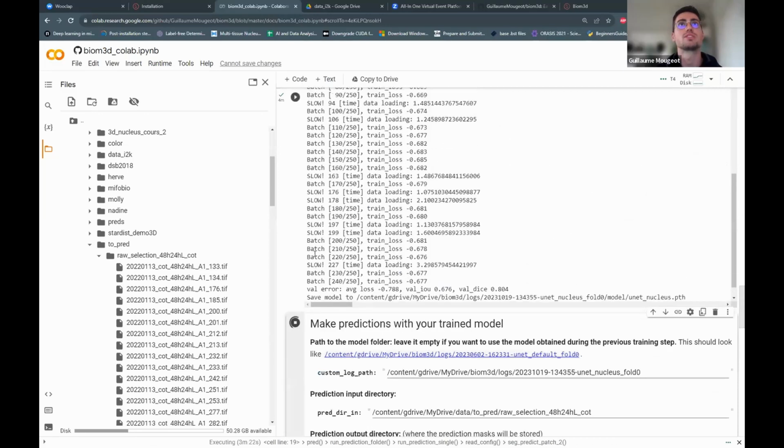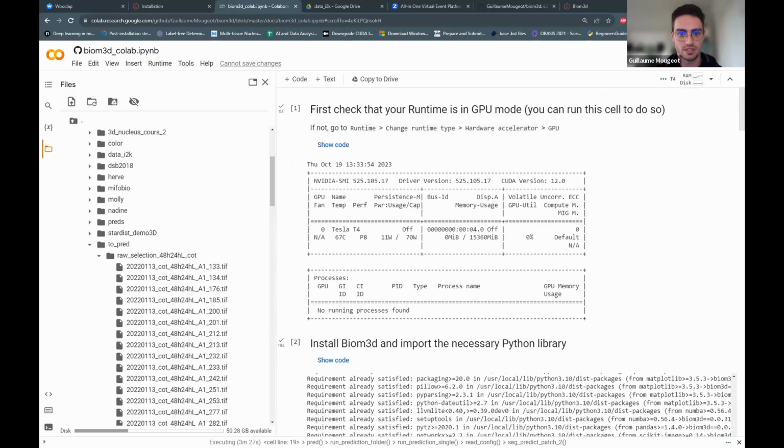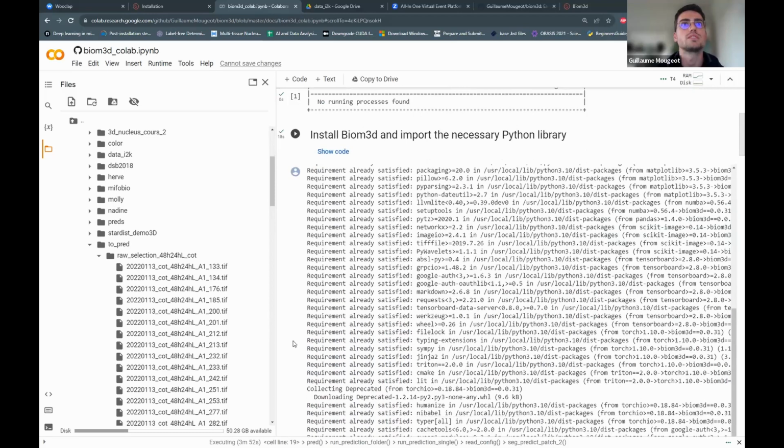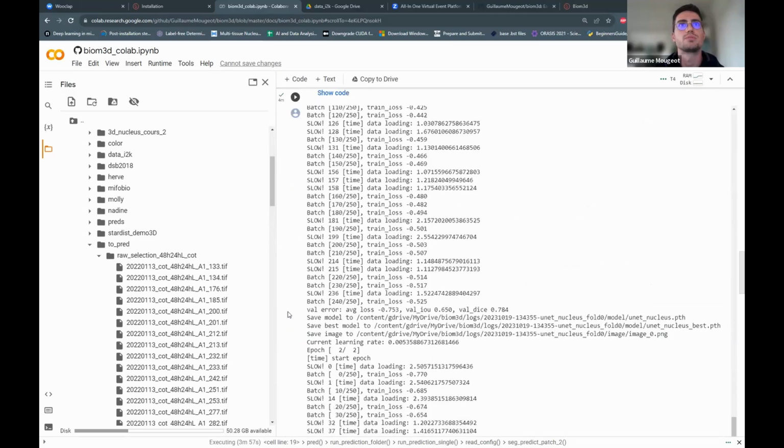If some of you are stuck on one step or stuck on the first step, I think what you've done, Li-Yuan, is that you've passed the parent folder.